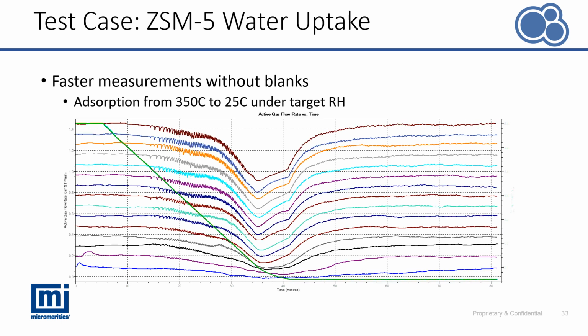Shown here is a 16-step isotherm created by blending in the Autochem of the ZSM5 sample with the silica to alumina ratio of 55. The temperature overlay in green contains the temperature of each measurement. This shows great temperature control and reproducibility. A vapor flow calibration was applied so that now the y-axis shows the appropriate active gas flow rates of the diluted blends. Each point takes about 80 minutes to measure.